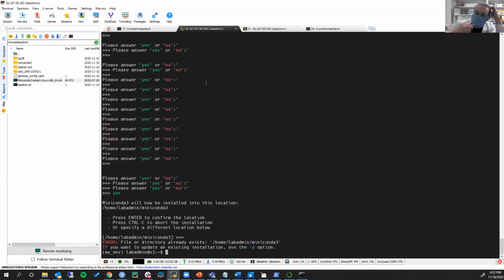And you did that on our virtual machines before we showed up, or are those pre-installed? Right, yeah, that's what I did. I did this on your virtual machines, and then they made an image based on the machine I had, and then they replicated it like 25 times so that you would all have the same thing as I had. I see. Okay. Cool. Yeah, but that's how you install Miniconda.